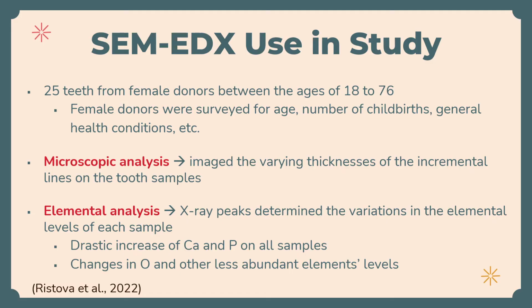So SEM EDX was used in the study. 25 teeth from females who had been through at least one pregnancy were taken. The female donors were between the ages of 18 to 76, so they had a wide range of individuals, and each of the donors was prompted to take a survey to gain basic information such as their age, the number of childbirths, and their current general health conditions.